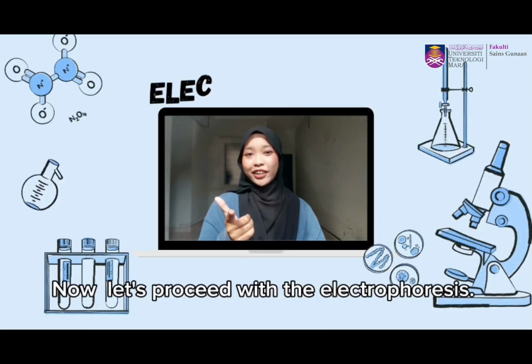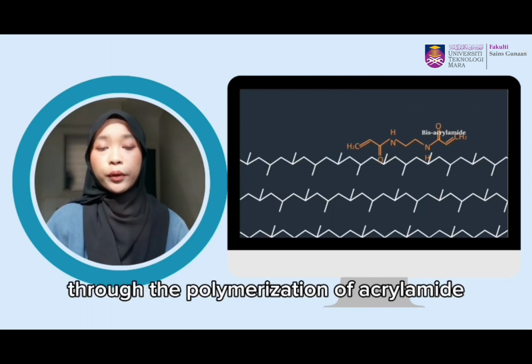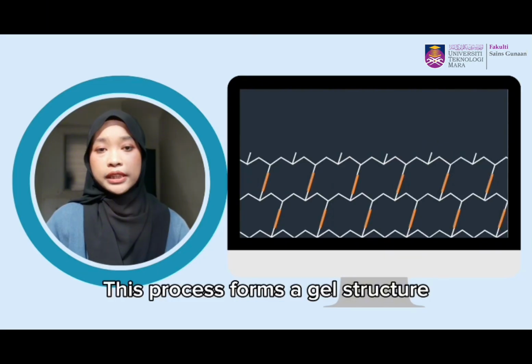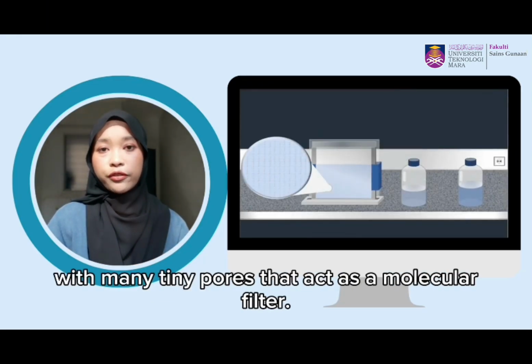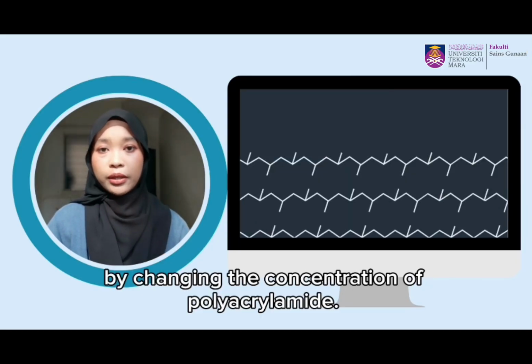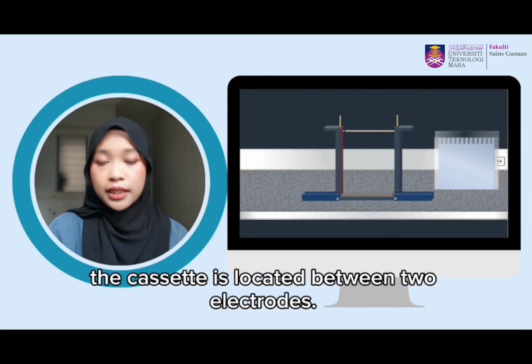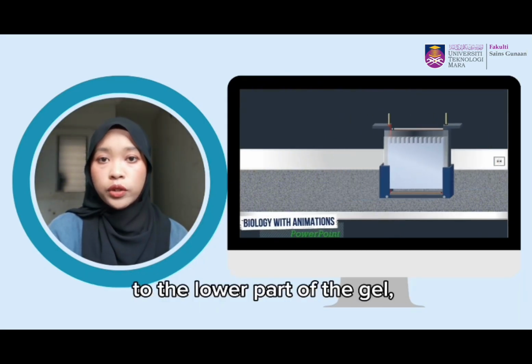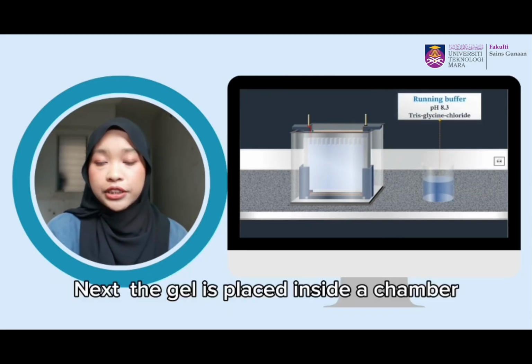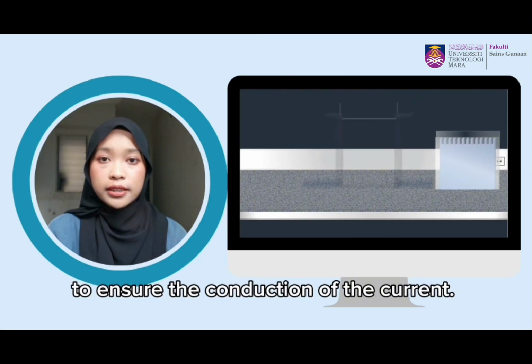Now let's proceed with the electrophoresis. Before electrophoresis, the polyacrylamide gel is prepared through the polymerization of acrylamide and cross-linking by bis-acrylamide. This process forms a gel structure with many tiny pores that act as a molecular filter. The size of the pores can be adjusted by changing the concentration of polyacrylamide. After the gel is prepared, the cassette is located between two electrodes. The positive electrode is connected to the lower part of the gel and the negative electrode to the upper part of the gel. Next, the gel is placed inside a chamber filled with running buffer to ensure the conduction of the current.